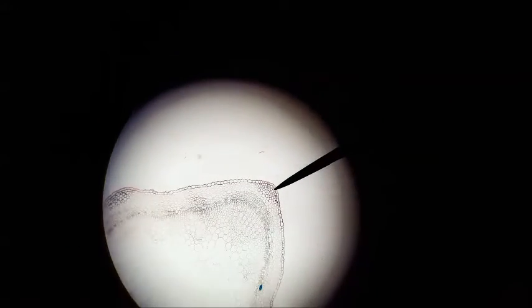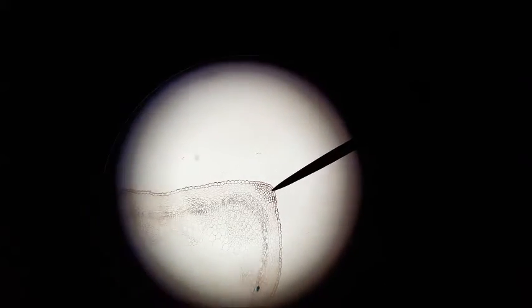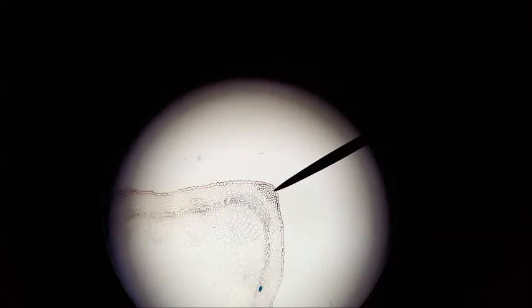On 100x magnification of the alfalfa dicot stem, that reinforced corner is pretty obvious — that is colenchyma. Of course, the outer layer is the epidermis. Thank you very much.